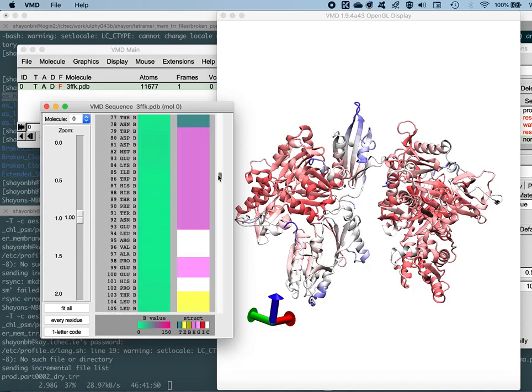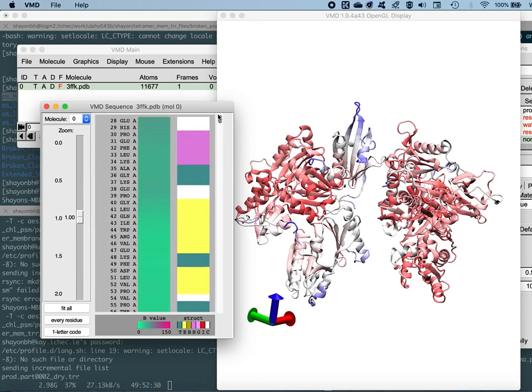So you see, within those green shades, there are a few regions which are darker in shade, as in darker green. So initially the residues starting from 28, so that's the N terminal of the gelsolin, you'll find that it's slightly darker in shade, which means those regions lie in the higher beta value regions.